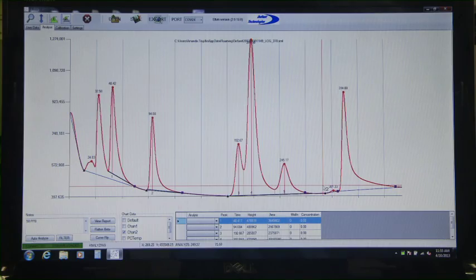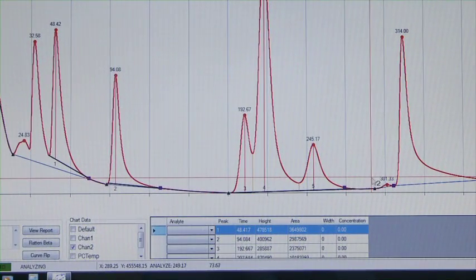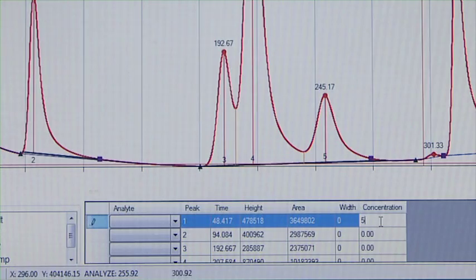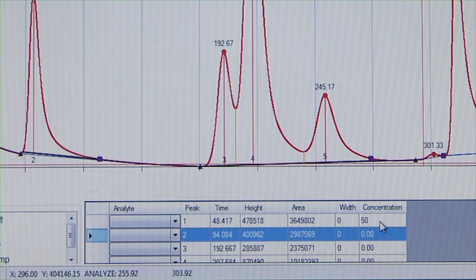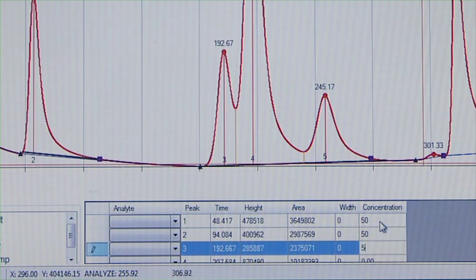After the peaks have been integrated, the analyte data grid displays the integration results. Enter the known concentration for the calibration standard into the data grid.